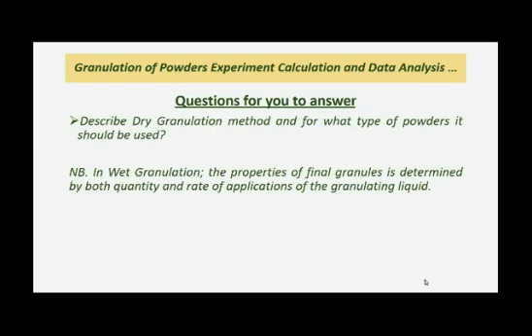Describe the dry granulation method and for what type of powders it should be used. Remember, in wet granulation, the properties of final granules are determined by both quantity and rate of application of the granulating liquid.